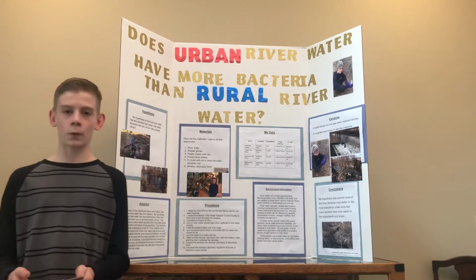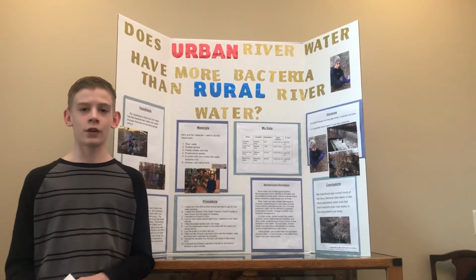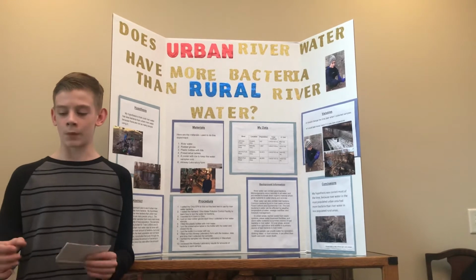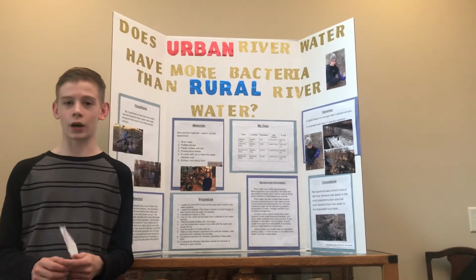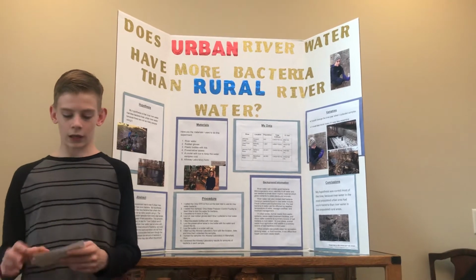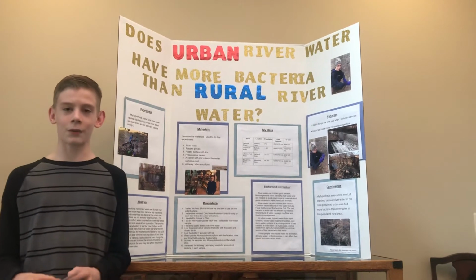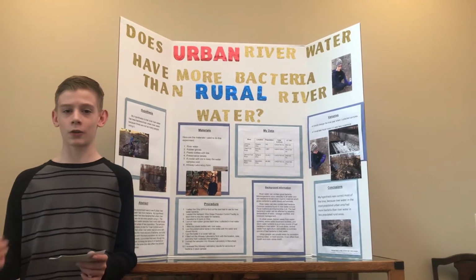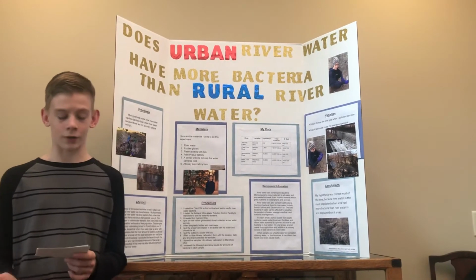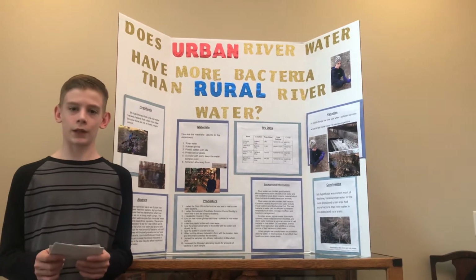And then I traveled to 4 rivers in Ohio, and at each river I put on new rubbery gloves and collected each sample with a plastic bottle. Then I put a preservative tablet into the bottle and shut the lid. And then I put the bottle in a cooler with ice and filled out the Alloway Laboratory form for the time that I collected it and the date and then where I collected it. And then I turned it into Alloway Laboratory in Mansfield.